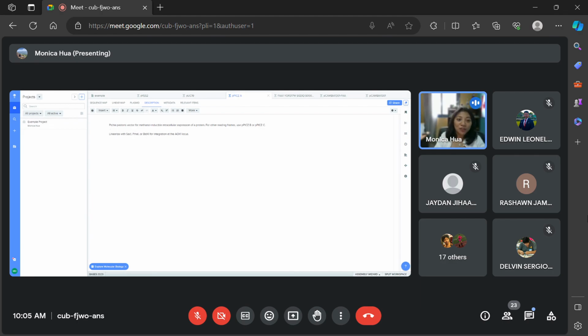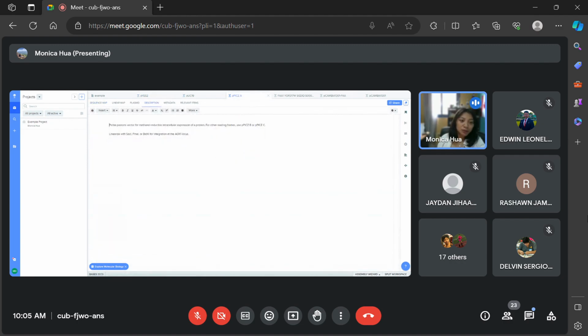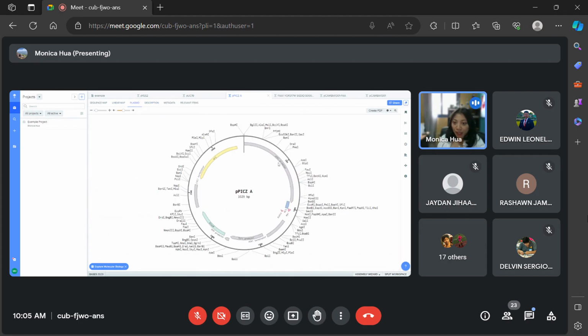But you would have to feed them methanol. For pYES, you feed the yeast galactose. For Pichia pastoris, in this specific plasmid, you have an AOX1 promoter, which is turned on with the presence of methanol, right?